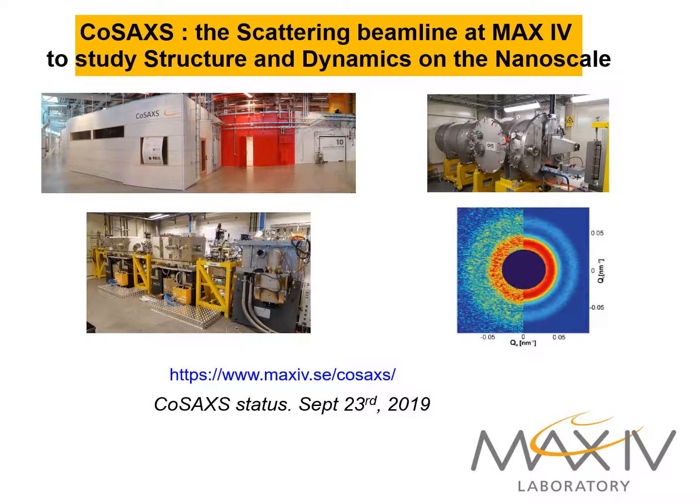Here are some pictures just to prove that it's actually more than just under construction, and some scattering patterns off the beamline.